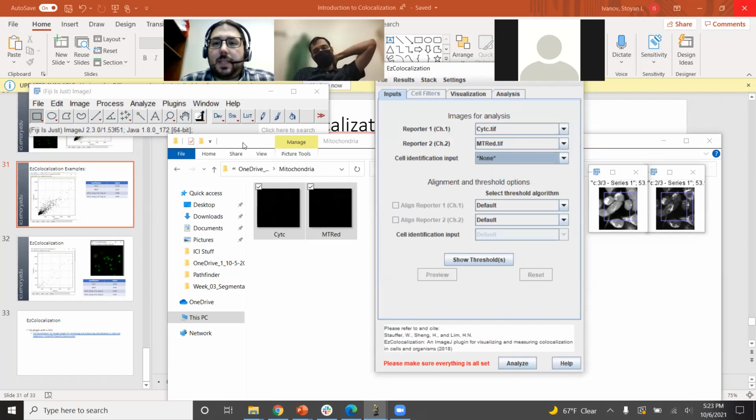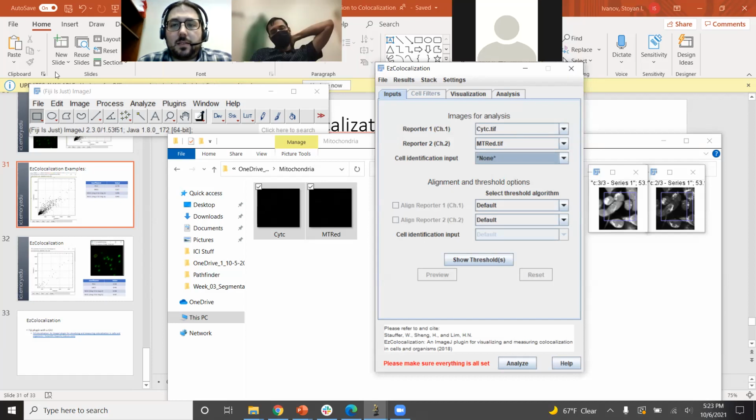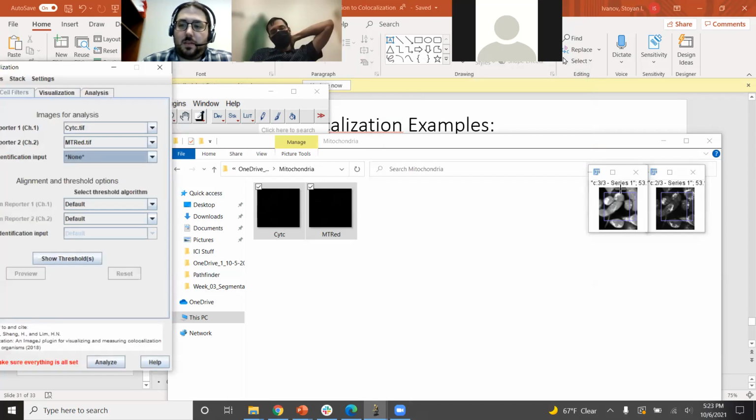So what Gaurav did is he specified an ROI in Fiji. So we can do that here.